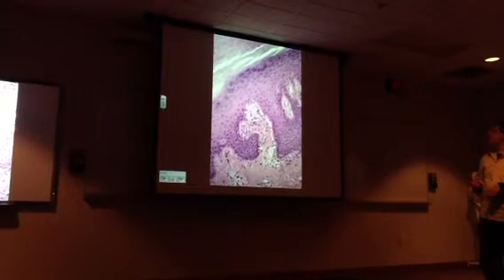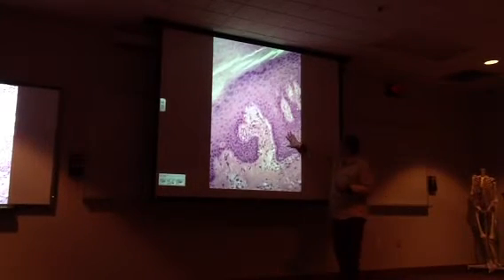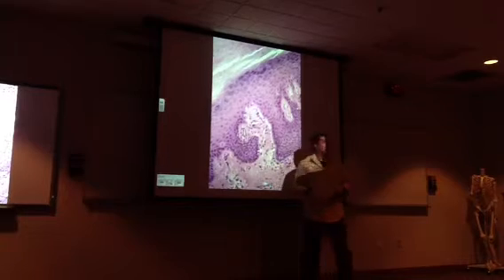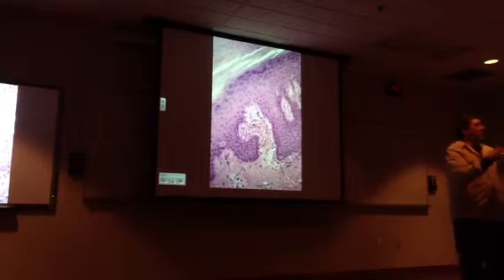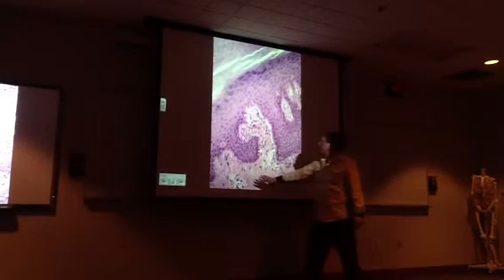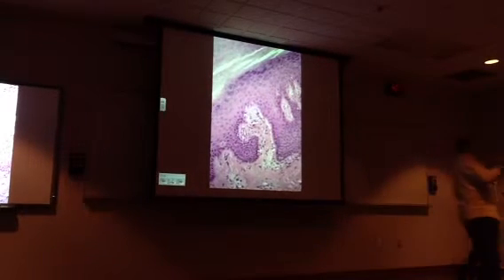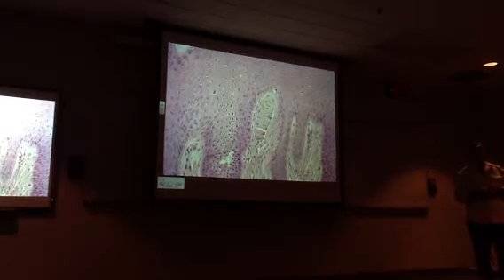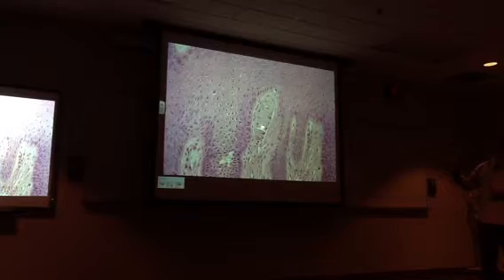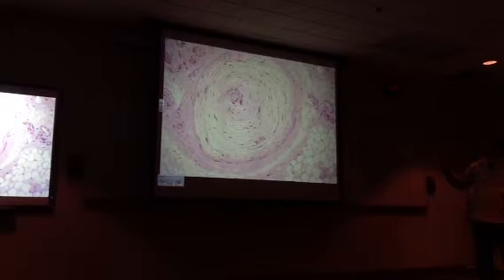If you think about the dermis and epidermis, they interdigitate with each other. So we could call this region of the epidermis an epidermal peg. I don't care that you remember that, but that's interdigitating with the dermal papilla, the underlying connective tissue. It's just a way to increase surface area of the epithelial sheet, to anchor the epithelium to the underlying connective tissue. And that's just a higher power view of these Meissner's corpuscles, as opposed to that one, which is a Pacinian corpuscle.